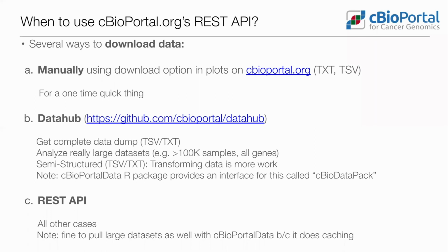And then lastly, what we'll be working with today is the REST API, and this is really for all other cases. This is really the recommended approach if you want to do anything else than what I just mentioned.